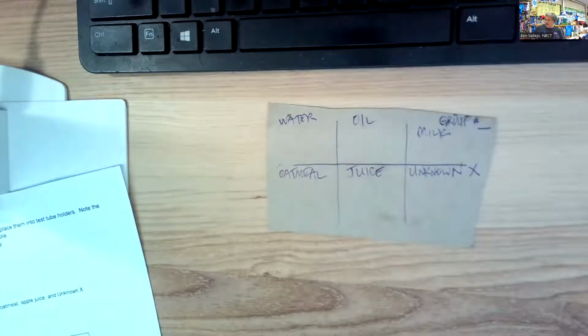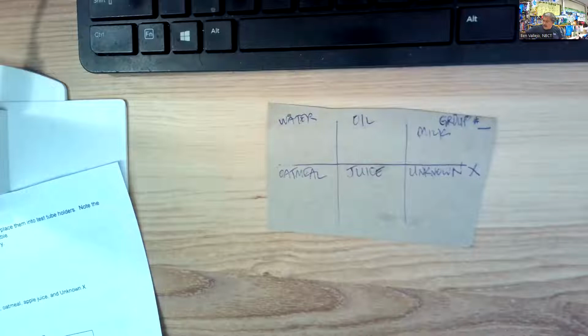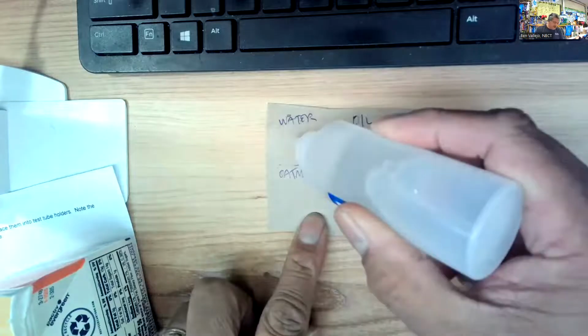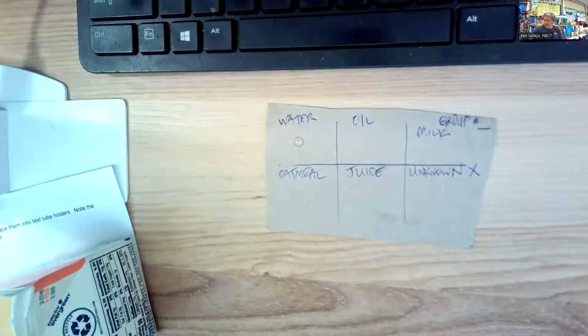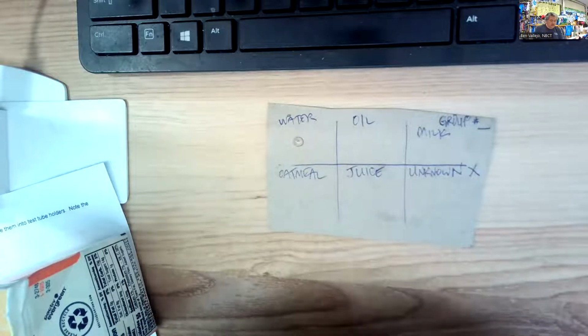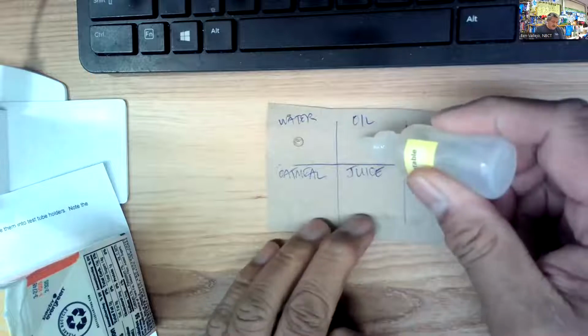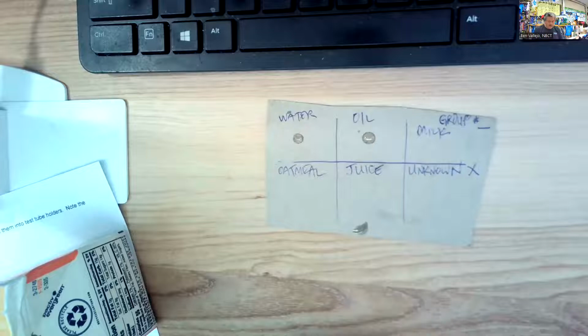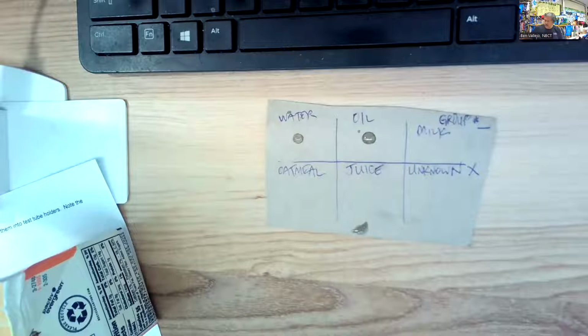Let's go with a drop of water. Here's a dropper bottle with water in it. Okay, I'm going to put a drop right there. All right, a drop of vegetable oil. Here we go, right here. All right, I actually got some down there with the juice. All right, we have milk over here.